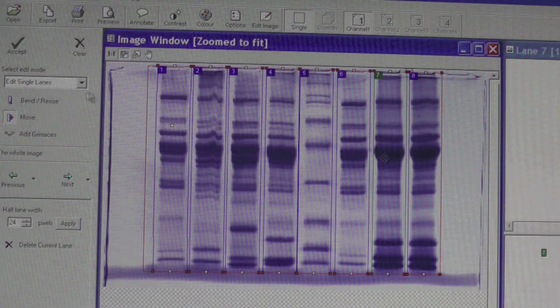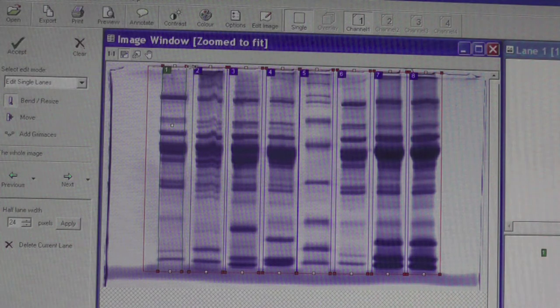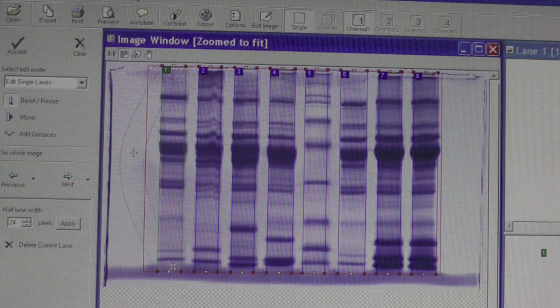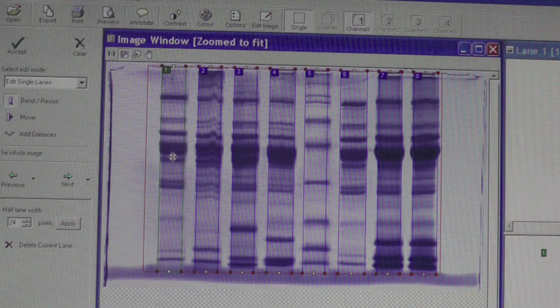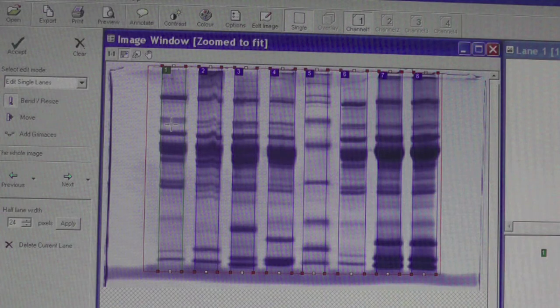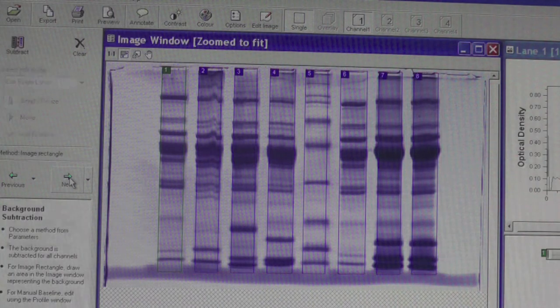Select the Bend/Resize button to trim off the sides of the bands. This produces better quality peaks for analysis. For lanes that are slanted, left click on the white square tie point to drag and fit the outlines diagonally. Left click on the center of each lane to add a white square tie point, and bend and stretch the outlines by left clicking on the tie point and dragging it to fit distorted gels. To remove tie points, right click on them. If you want to edit all lanes at once, select Edit Multiple Lanes from the drop-down menu. When you're happy with your lane positioning, click Next.